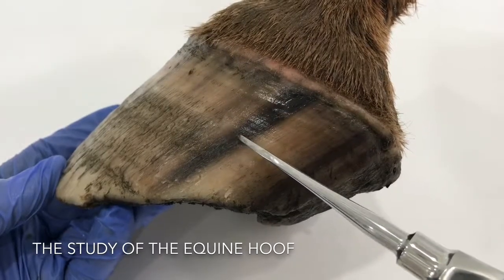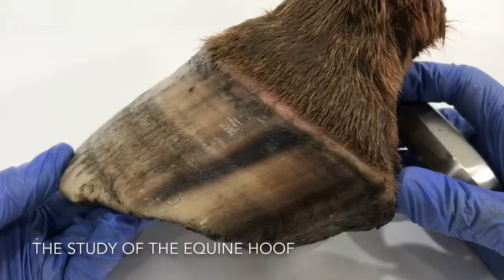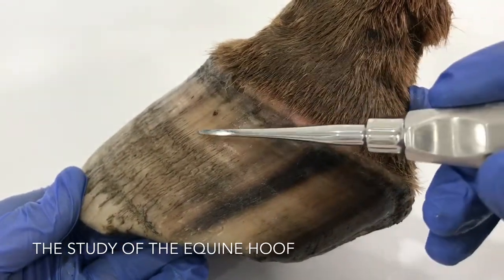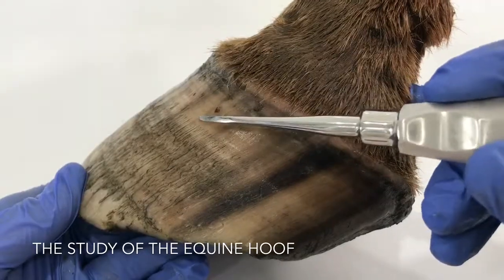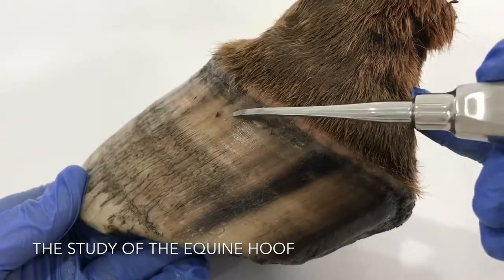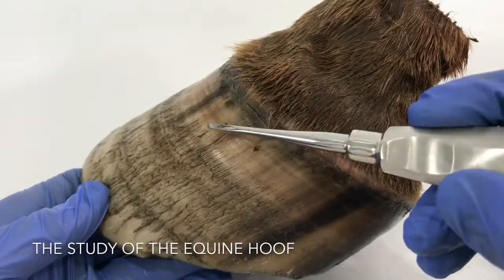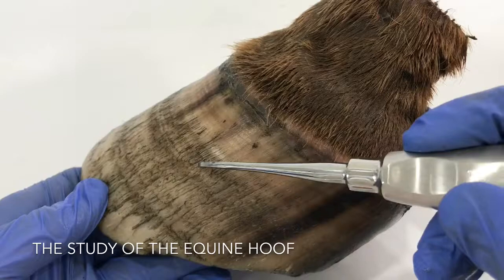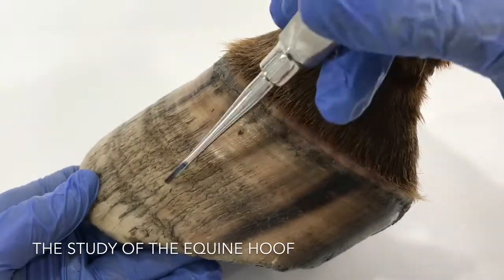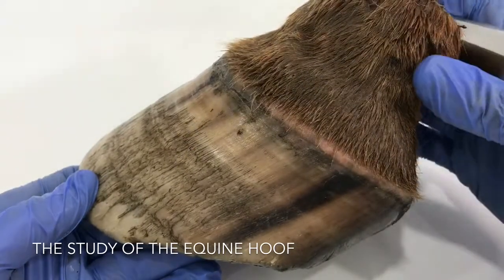We don't know why it's good growth here and poor there. It could be a mineral change or a change in diet — better pasture. This hoof was culled in the winter, so it could be that it received extra feed during the winter months, which shows better quality hoof at this point compared to this point. But you can see quite clearly the quality difference between the two parts of the hoof is quite profound.